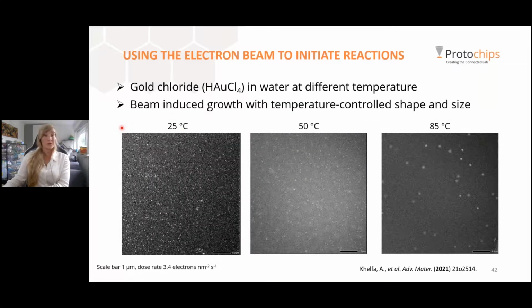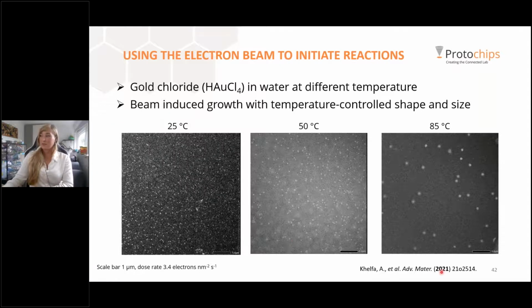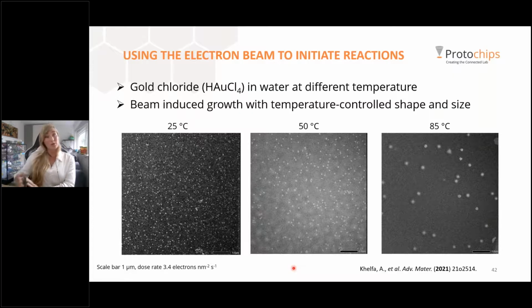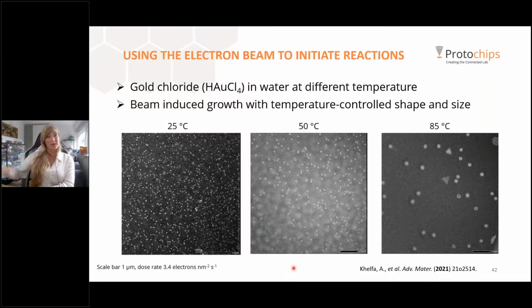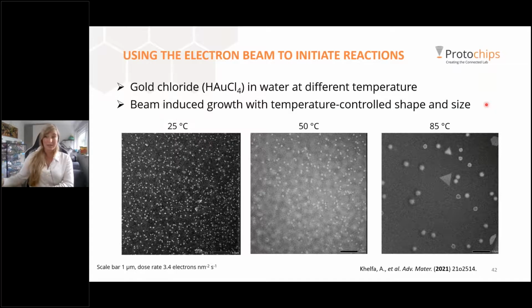However, people have also used the beam for their research. In this paper from 2021 in Advanced Materials, they were looking into how we can grow gold nanoparticles using a gold chloride solution at different temperatures, and how the temperatures change the kinetics of the reaction. You can see immediately, when they start off with the temperature and then start adding this beam in dark field STEM mode, that the particles that are growing have completely different sizes and shapes depending on the temperature. The dose that we're using was exactly the same.